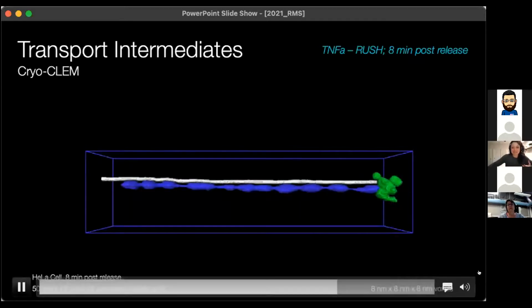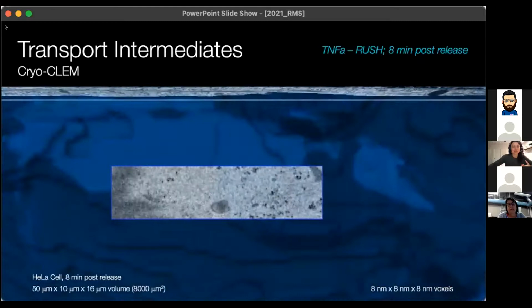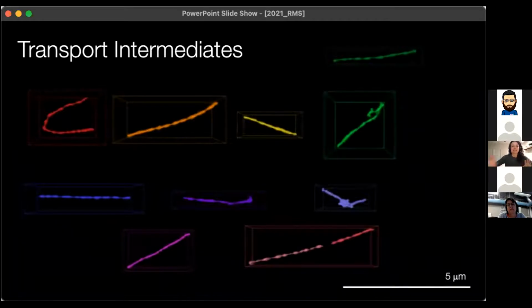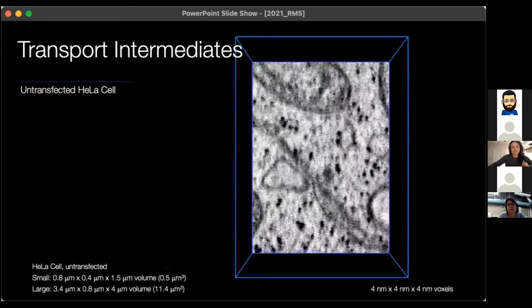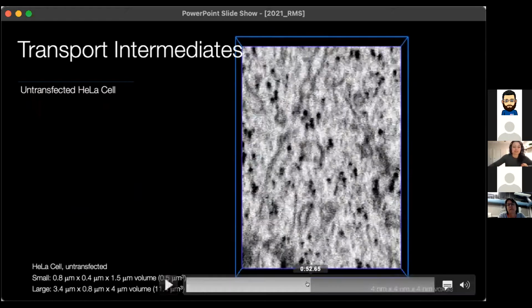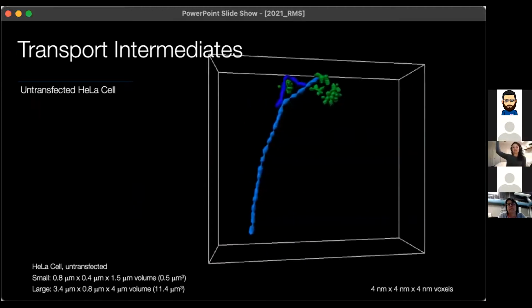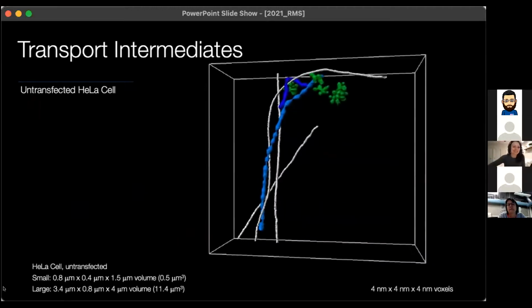And so because we have the wild type data, we can also look at this in, well, I should mention that there's plenty of these across an entire cell. So here are 10 such transport intermediates within just this one quadrant of the cell that we identified, all having this pearled membrane feature. And then we are also able to see this in an untransfected cell. So this wasn't just the result of over-transfecting this rush cargo. So I'll skip ahead here so you can see the main result. So you can see this huge pearled membrane being pulled out of the exit sites and always along these microtubule tracts, which is really spectacular.